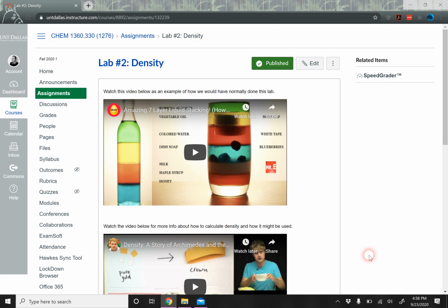Hi everyone, I just want to take a minute or two to go over lab number 2 with you, which will be density. So the first thing you'll need to do is watch this video, and this will be sort of giving you an example of a lab you might have performed if we were face to face. It's a pretty cool experiment where you put some liquids into a container and you actually see the layers separate out based on their density.